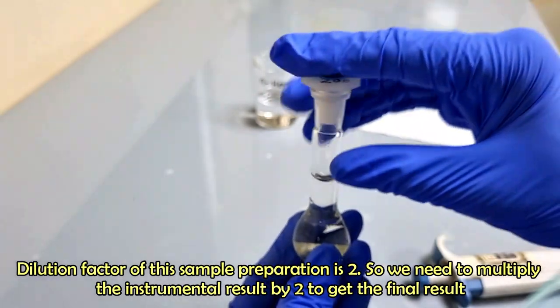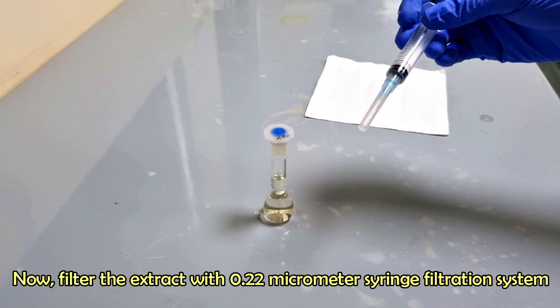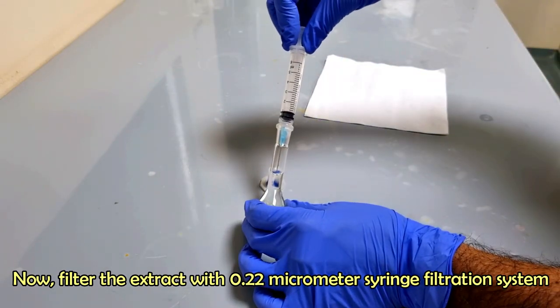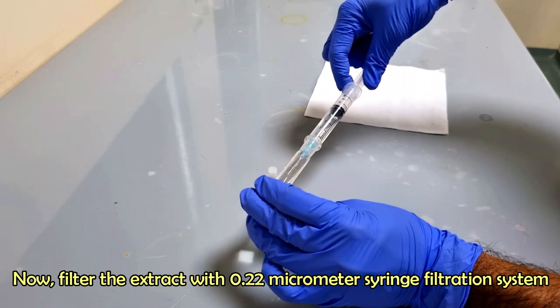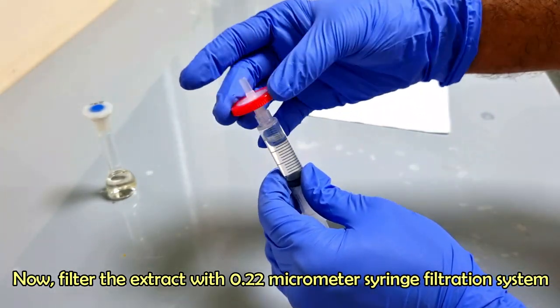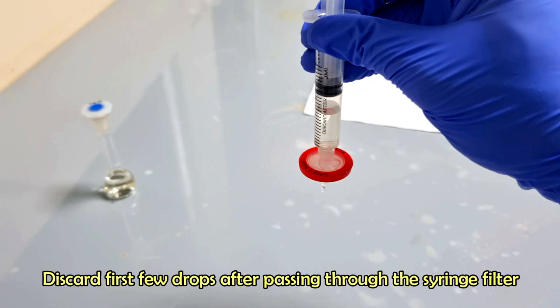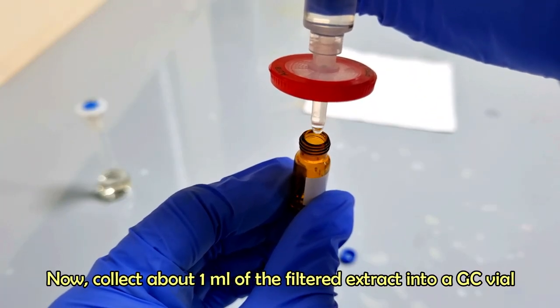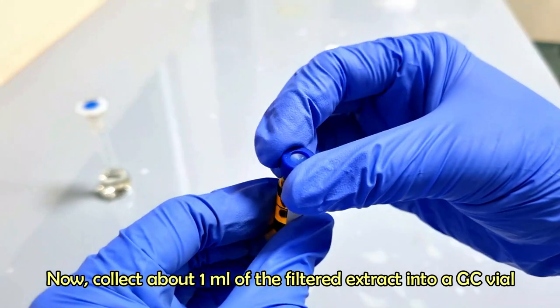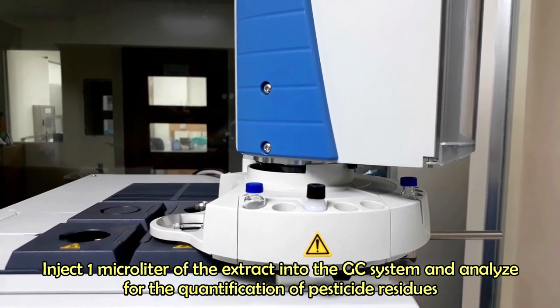The dilution factor of this sample preparation is 2, so we need to multiply the instrumental result by 2 to get the final result. Now filter the extract with a 0.22 micrometer syringe filtration system and collect into a GC vial. Inject 1 microliter of the extract into the GC system and analyze for the quantification of pesticide residues.